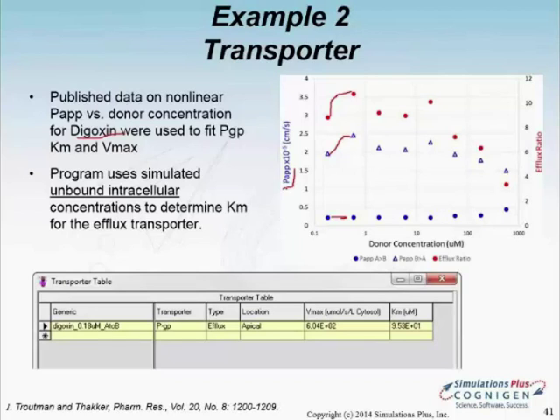With Caco-2 cells, how do you account for the low expression of CYP3A4/A5? We actually don't have built-in expression levels, just because this can change from one system to another. So at the moment, that low expression would be lumped within your Vmax value. If the expression is very low, you would not even have to worry about losing the compound significantly due to metabolism.